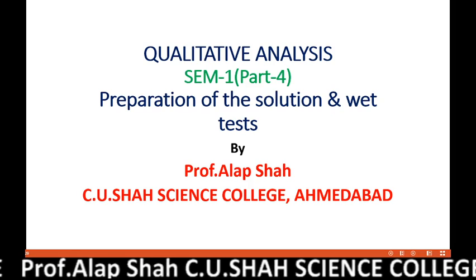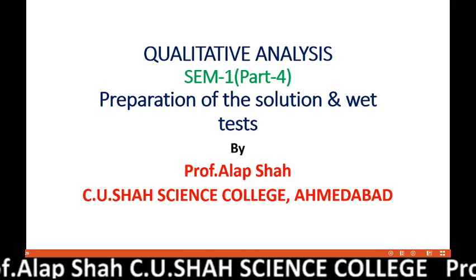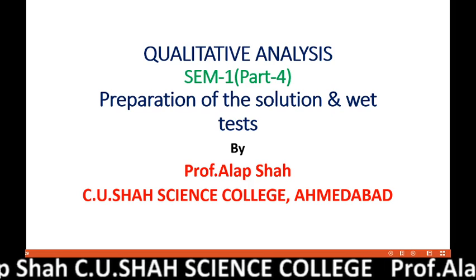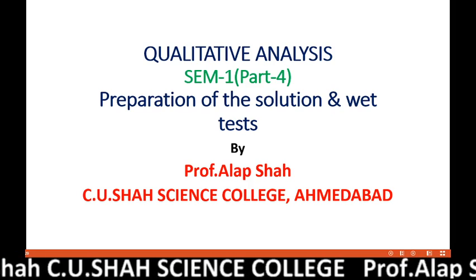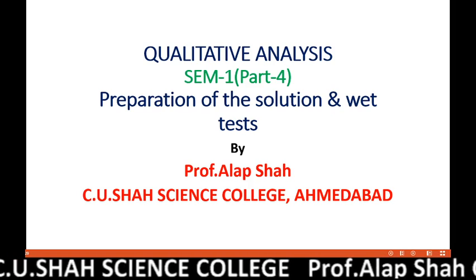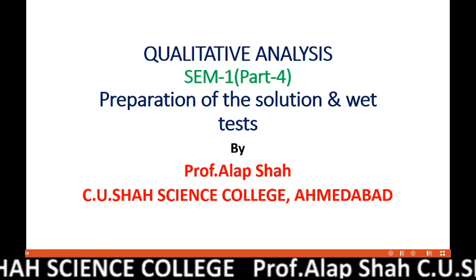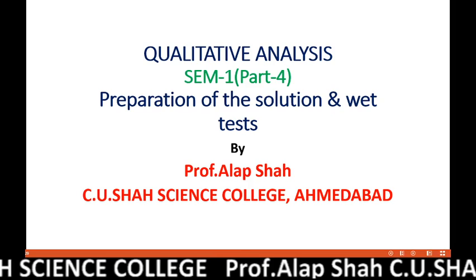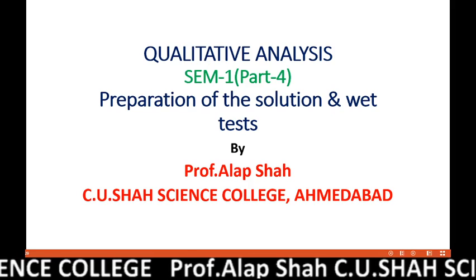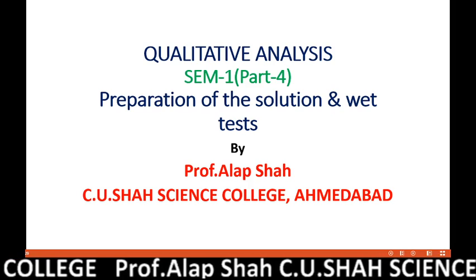Now in the last part 5, we will discuss the whole format of the qualitative analysis for your semester 1. In part 5, I will share a complete qualitative analysis demonstration. So far we have discussed all the tests in different parts, so we will quickly discuss one substance so that you will get the complete idea.